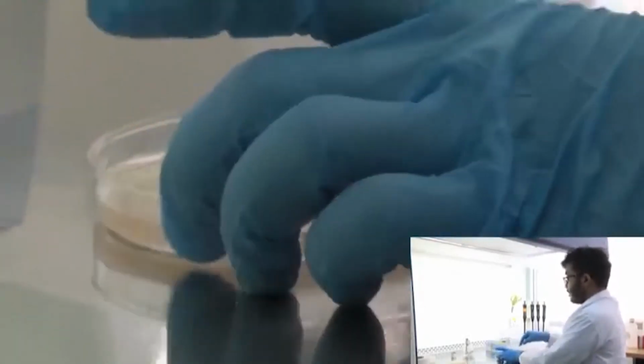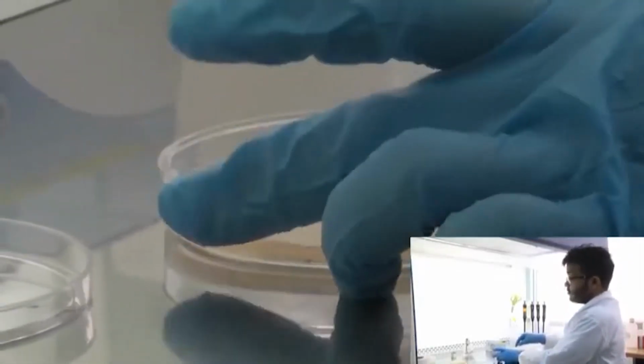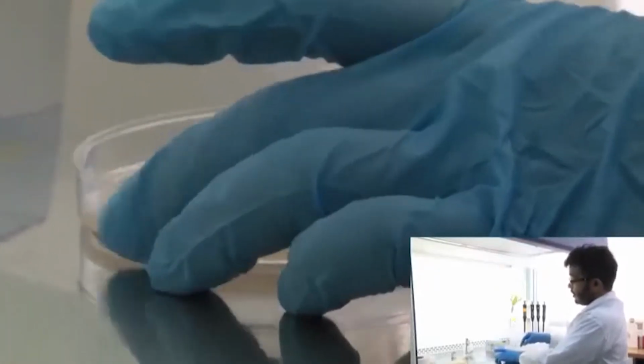Once that is done, I'm going to use it to spread the culture uniformly across the entire surface. I use the spreader, and using my hands I keep turning it, so there is a rotational motion with one hand and a translational motion with the other.